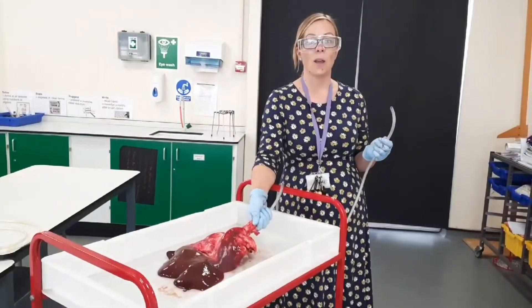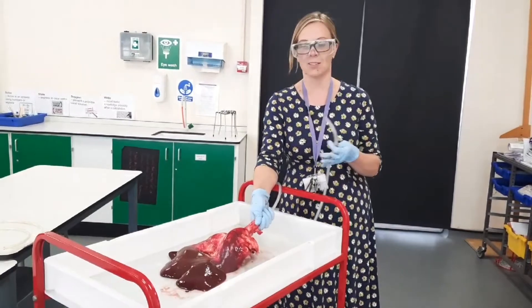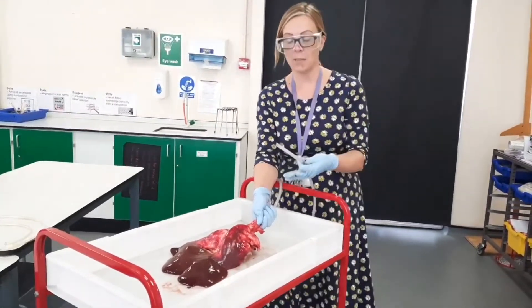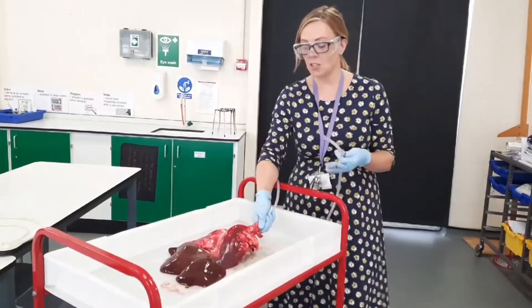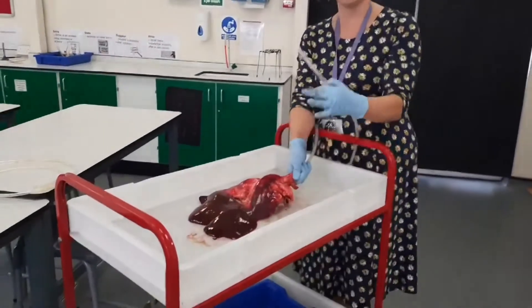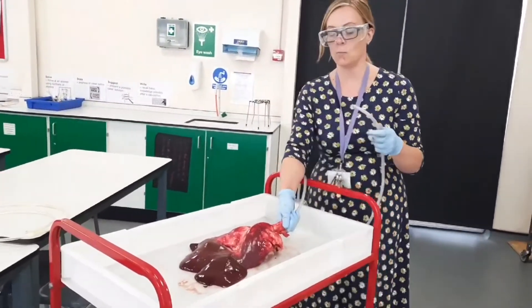So in biology we try as much as possible to use animals to demonstrate things that are happening in humans. Here we have some pigs' lungs and as you can see the lungs are just above the liver. Now it looks like the liver is much bigger than the lungs, but look what happens when we inflate them.